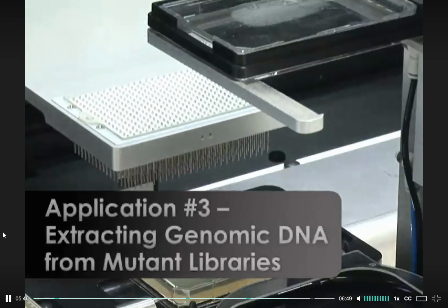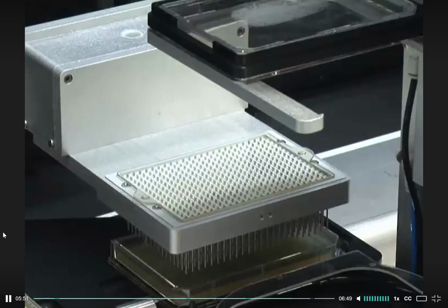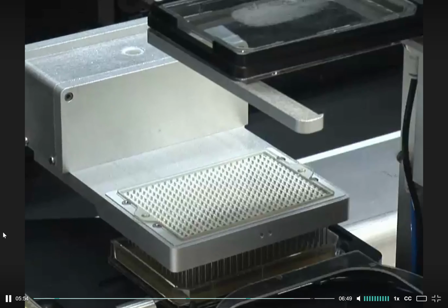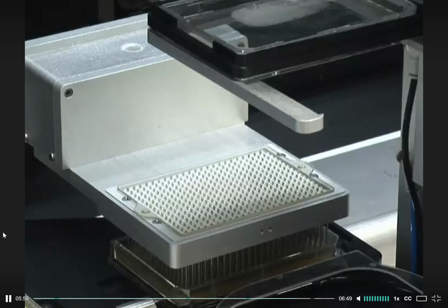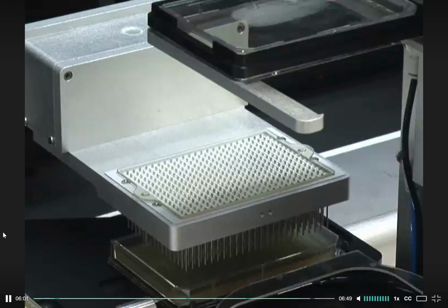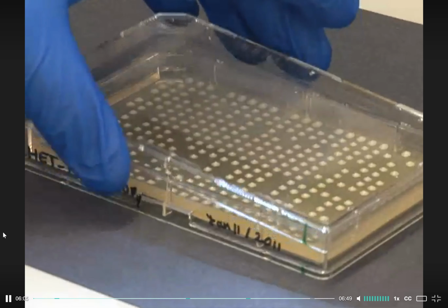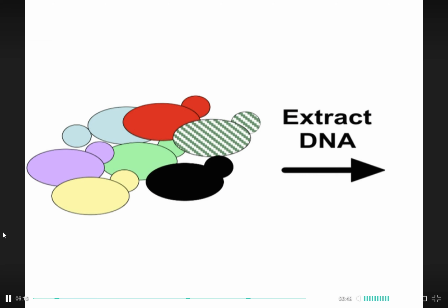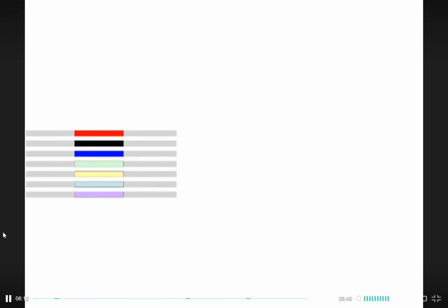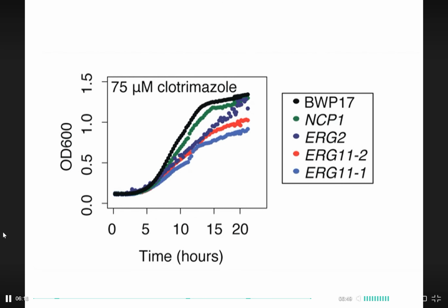In this video, researchers make use of a robotic system to prepare a library of genome-wide yeast mutants, which are used to evaluate gene function. Due to the insertion of specifically engineered sequences called genetic barcodes into genes, genomic DNA from mutant strains can be extracted from 4,000 to 6,000 individuals simultaneously and subjected to microarray analysis or sequencing. Based on the relative abundance of the barcode sequences, the fitness of each mutant can be determined under multiple experimental conditions.